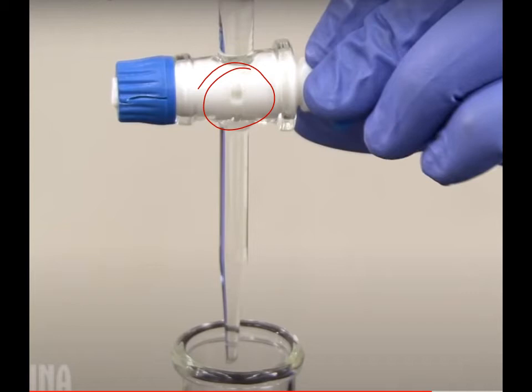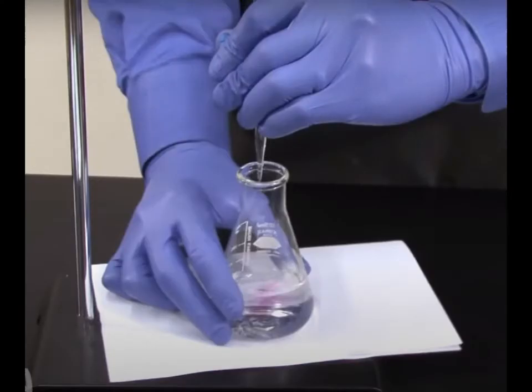You actually have to practice. You have to get good at using this instrument. And we usually spend a whole day just learning how to use this burette and how to read the numbers off it properly.